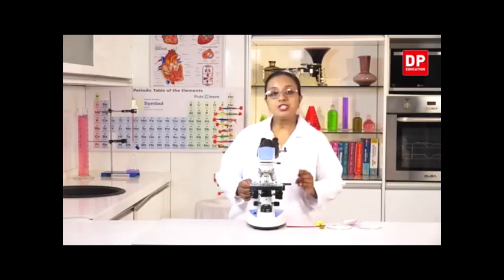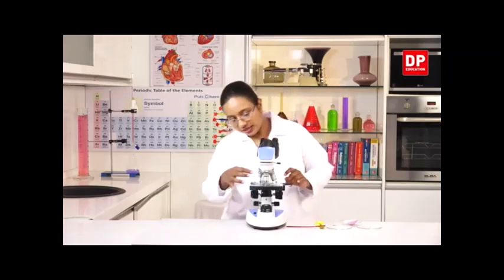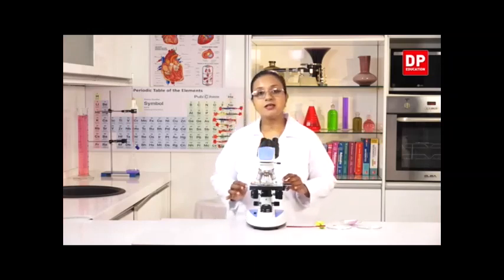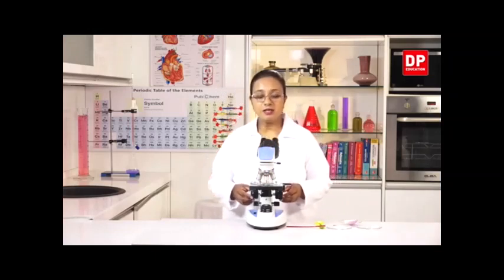Then as you know, there is more than one lens, those are the objectives with different powers. You all know what power you should use first. Yes, it is the lowest power and that has the shortest length. With the lowest power, I will have to use the coarse adjustment now.